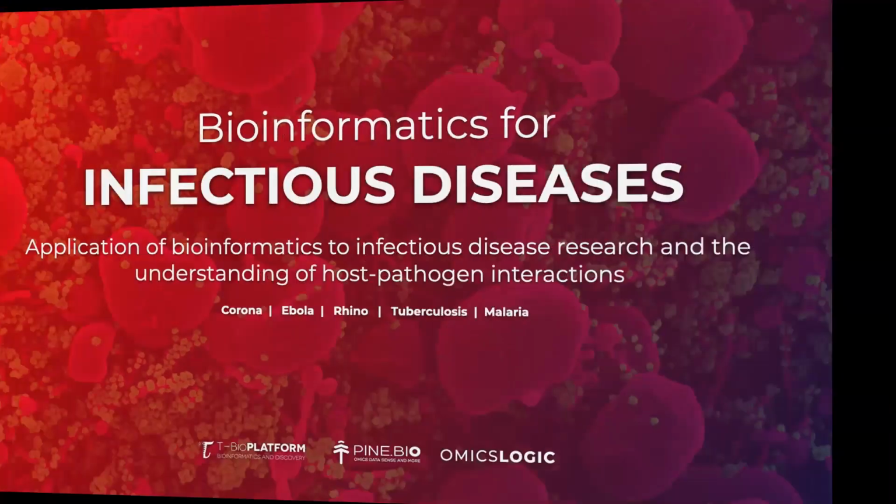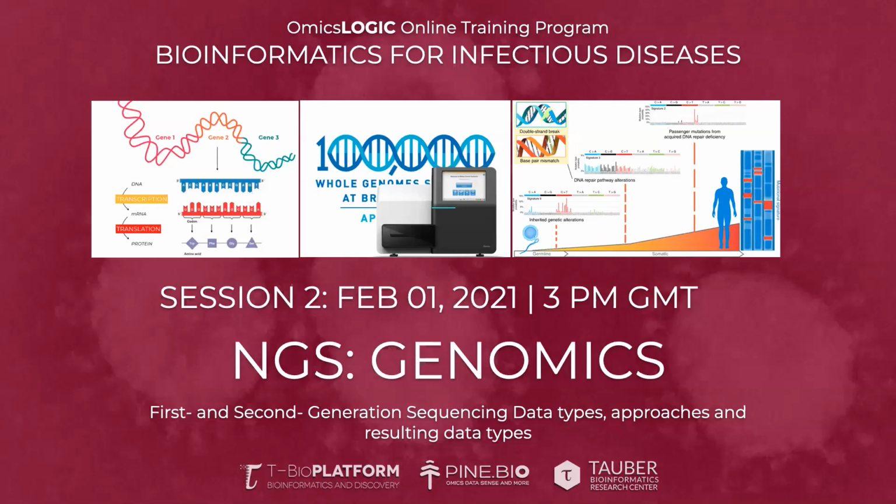Last time we met, we started talking about how this program is going to work, and we're going to review that in a little bit. But this session is going to be dedicated to next generation sequencing genomics. We're going to look at what types of sequencing data there are, how that data is stored and organized, and what we can do with those different types of files and data types.